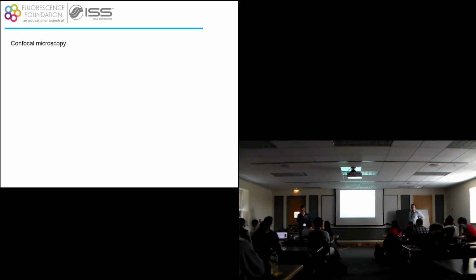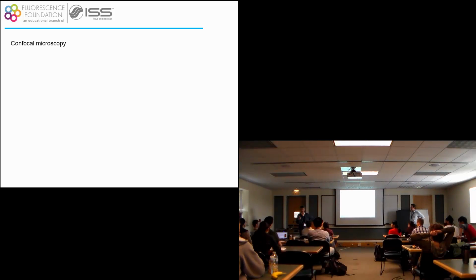Nothing. It was just a citation, and I just wanted to point out how the concept of fluorescence microscope was introduced more than 100 years ago, the confocal after 60 years. And this was just his observation of how some of these ideas are really slow to mature, coming to light. They are two separate things.